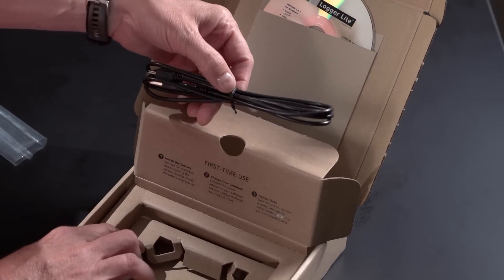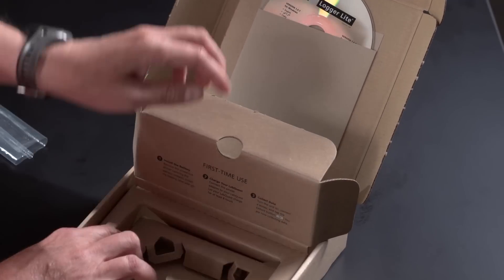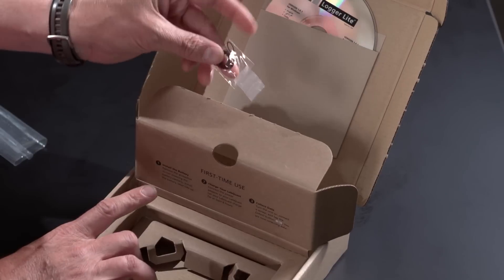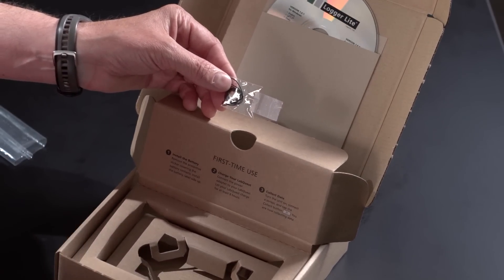USB cable — this is used to connect LabQuest 2 to your computer. And a tether to attach the stylus to LabQuest 2 so it won't be lost.